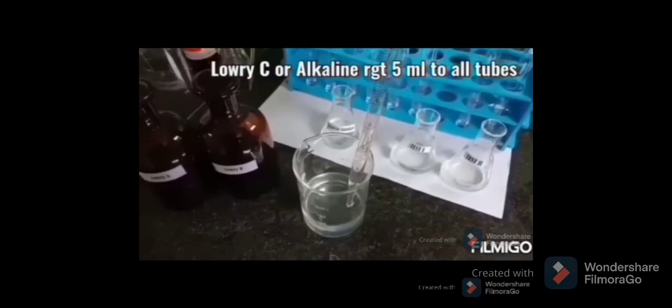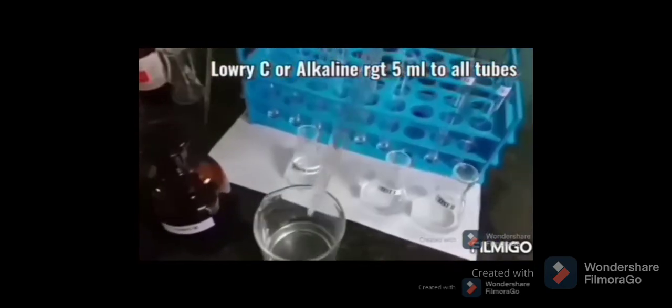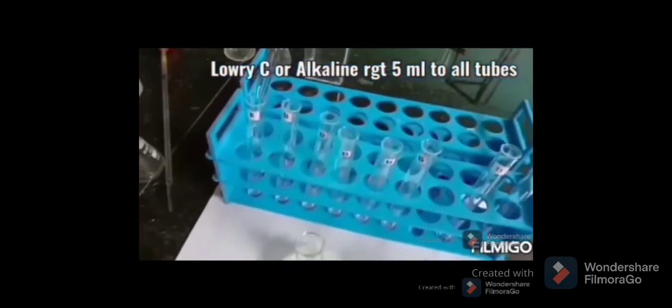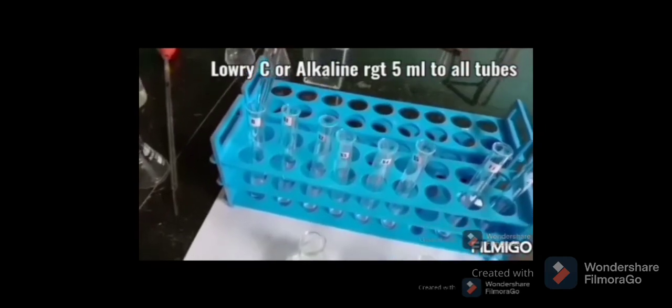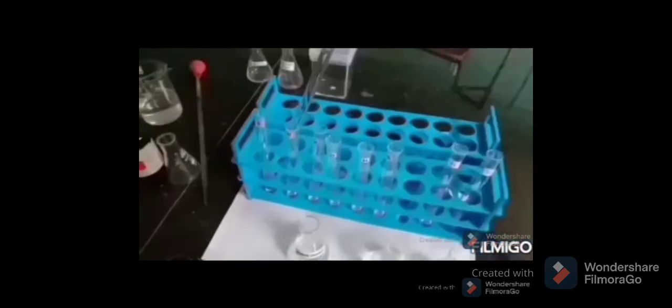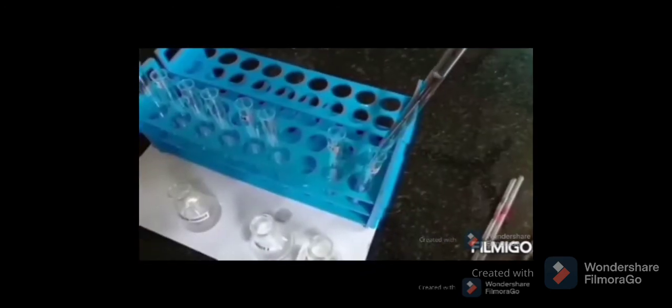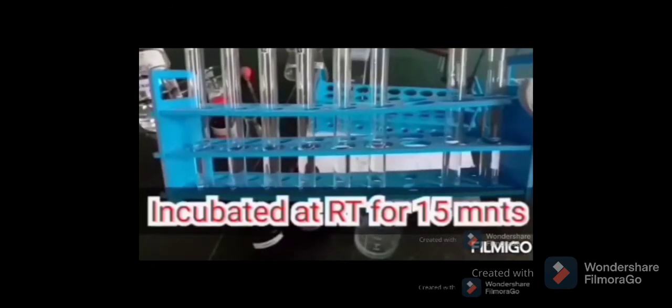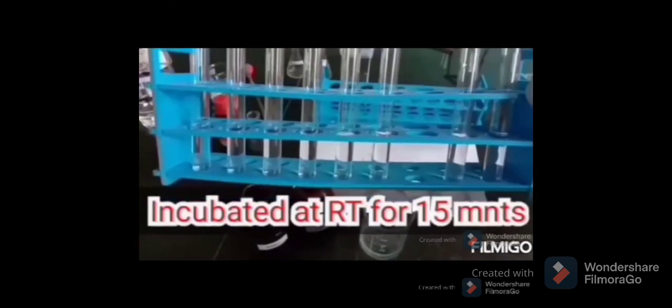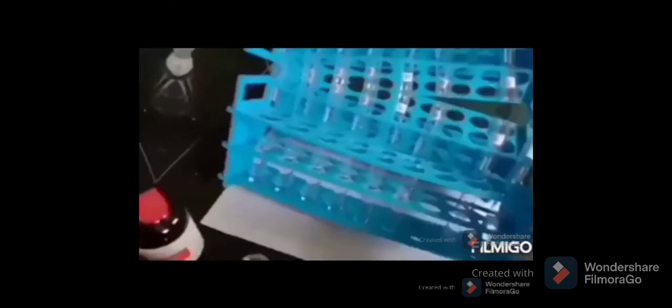Now 5 ml of alkaline reagent, Lowry C, is added to all tubes. Lowry C is prepared fresh by mixing 50 ml of Lowry A with 1 ml of Lowry B. This makes a total volume of 7 ml in all test tubes and this is incubated at room temperature for 15 minutes.